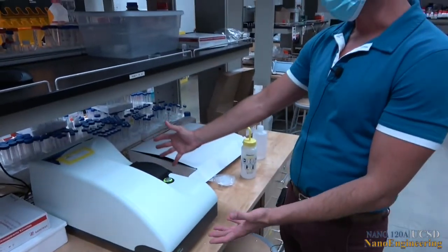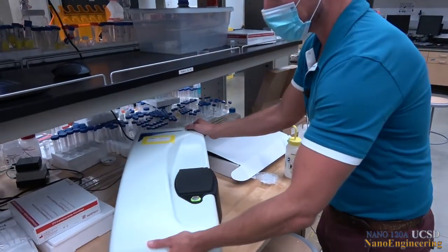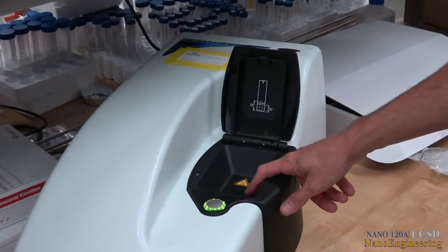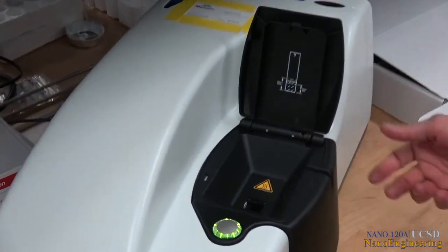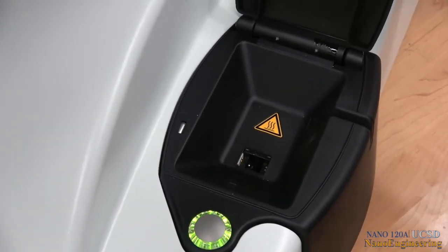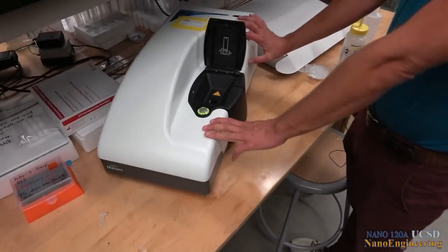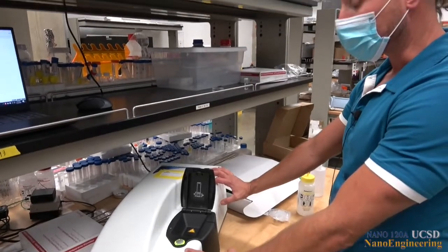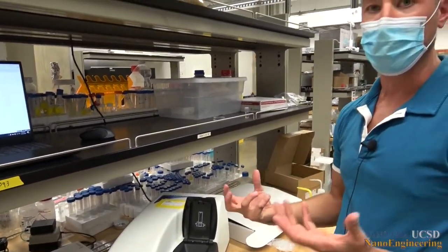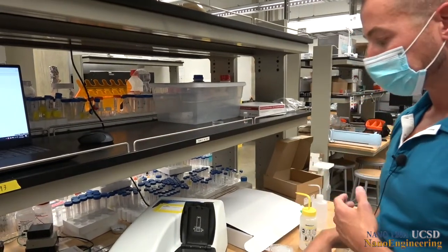This is what the instrument looks like. If I turn it a little bit, you can see where the sample goes. So this is probably the most black boxy instrument that we have this year. And the reason it's so black boxy is because the technology has pretty matured. And so any control that you need to do is going to be done with the software.